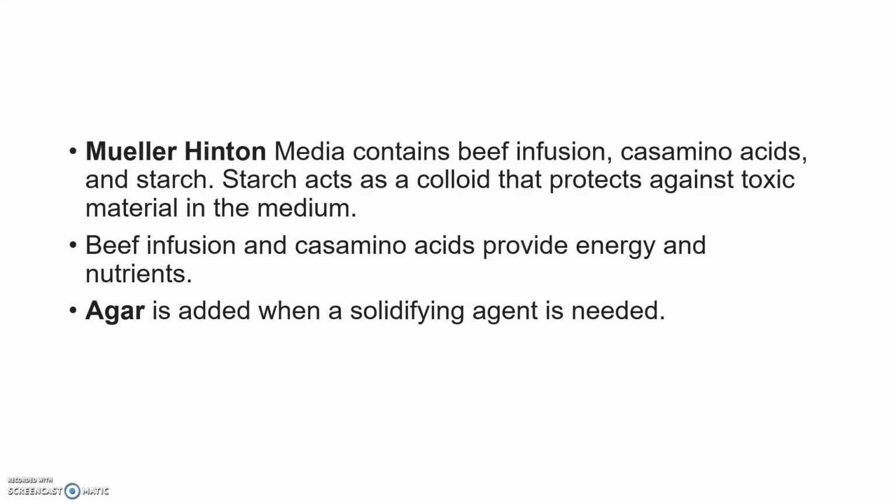The starch acts as a colloid in the medium that protects against toxic materials. So these are the ingredients of the Mueller-Hinton agar. Beef infusion and casamino acids provide energy and nutrients for the bacteria. Agar we are adding as a solidifying agent.